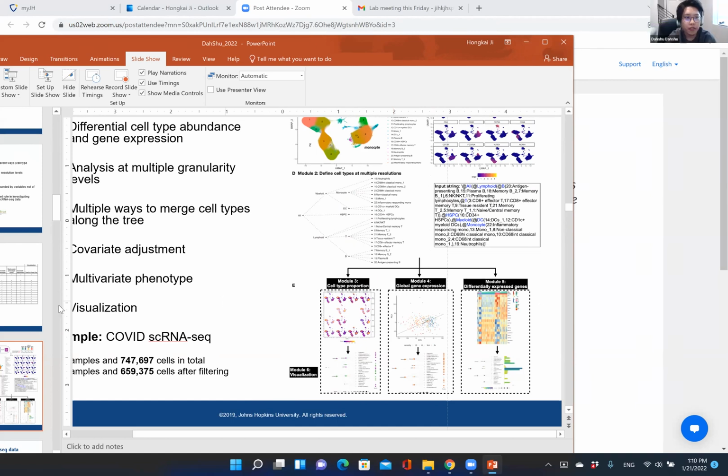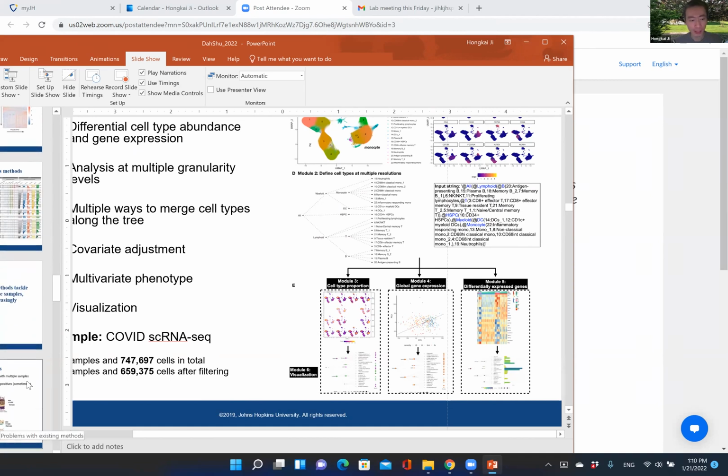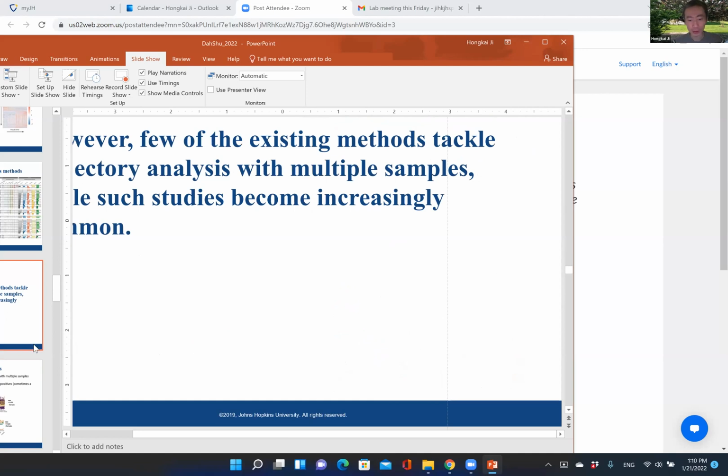And for the Lamian analysis, the version we showed in the preprint is a relatively slow version. For that, you need multi-core and a lot of memory to run the hundreds of COVID samples, for example. But we are currently revising our manuscript based on reviewers' comments, and we are trying to reduce the computational burden. So our newest version, which has not been released yet but we expect to release very soon with our revision submission, becomes quite efficient because we did a lot of optimization in terms of how to handle memory and data storage efficiently.